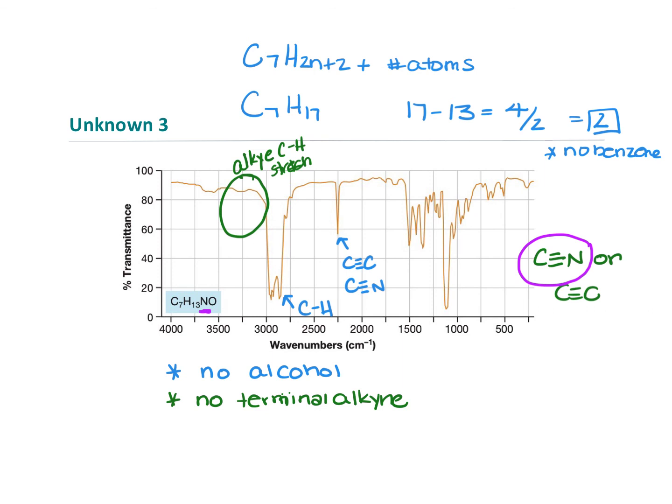I also want to point out we don't have any carbonyl bonds, right? Because we don't see anything in that C double bond O stretching frequency for carbonyls. Also, that would take up another IHD number. So there's no way it can be that as well. That might be the only information that you get out of this, and that's completely okay.